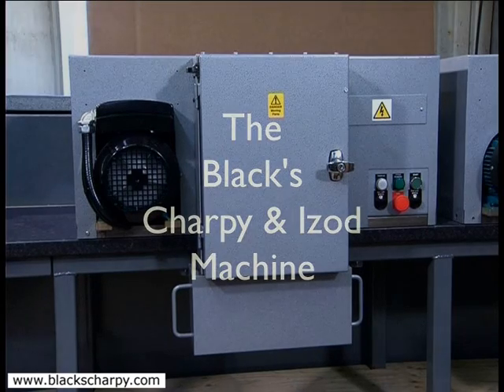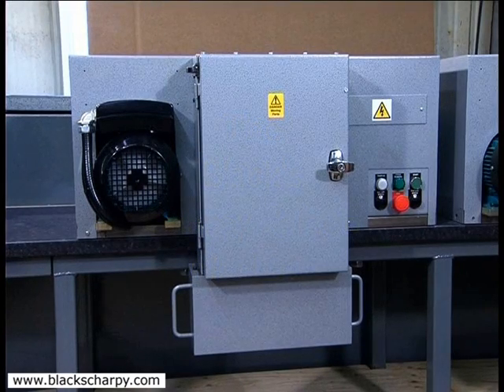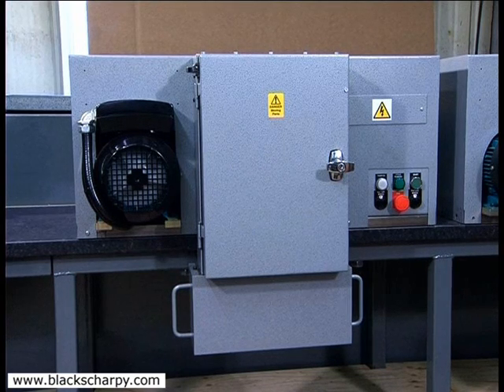Thank you for taking the time to look at this video, which shows the operation of our Charpy and Izod specimen machine.